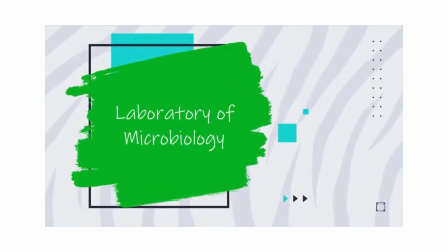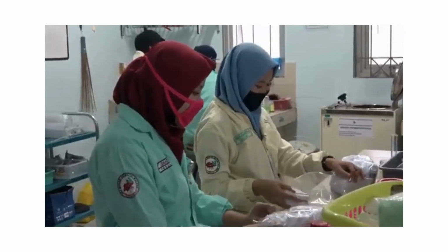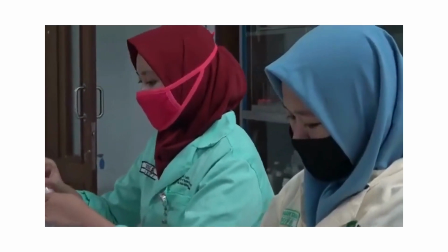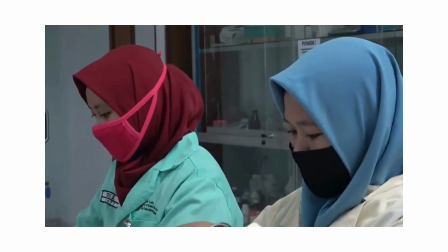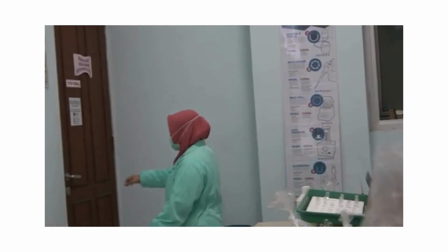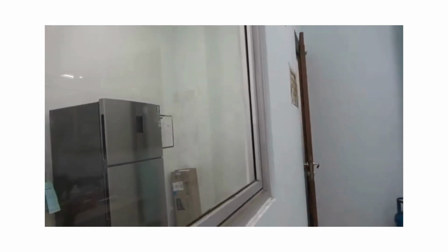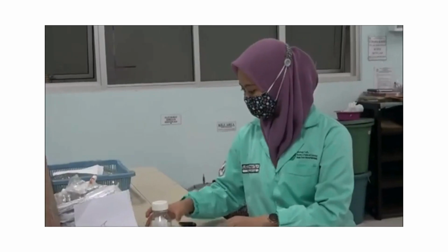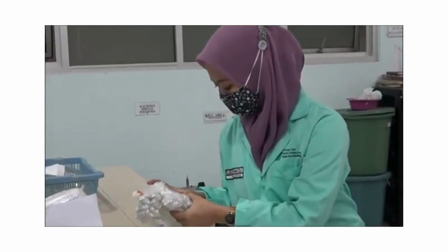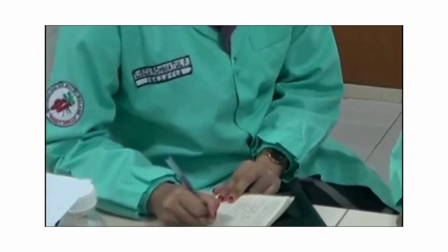Laboratory of Microbiology. The Laboratory of Microbiology is used in research and education in basic microbiology, environmental microbiology, application areas of health and food microbiology, mycology, and related subjects. The Laboratory of Microbiology is supported by human resources who have educational backgrounds in environmental microbiology, food microbiology, biotechnology, and mycology. It is equipped with sophisticated equipment for the teaching and learning process and research. This equipment includes autoclave, centrifuge, spectrophotometer, laminar airflow, microscope, microbial propagation room, and etc.